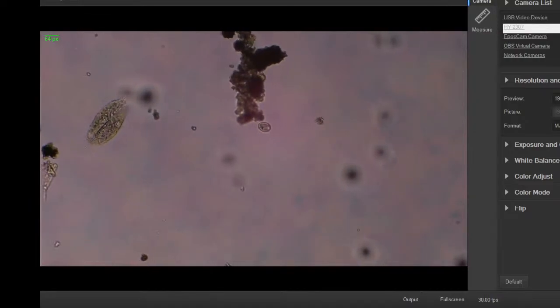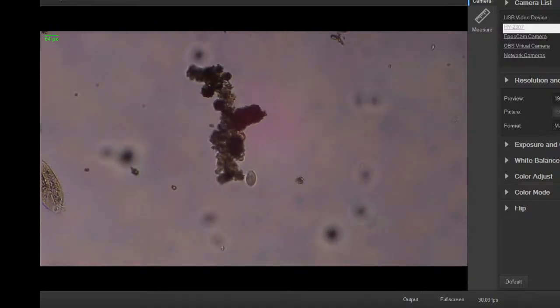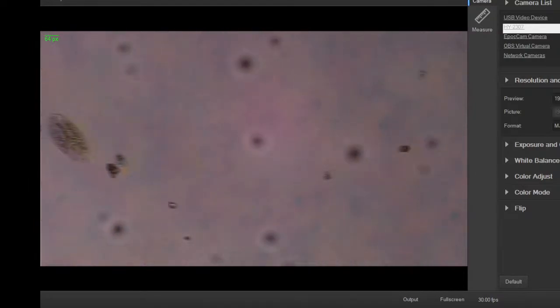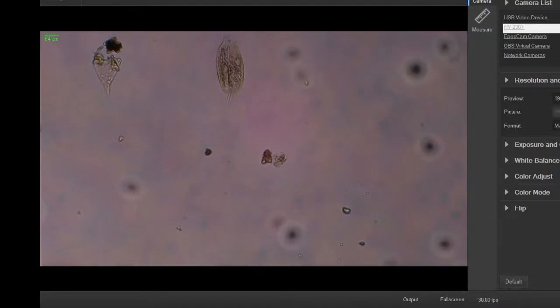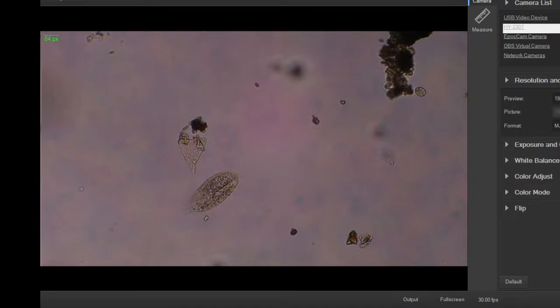It just stopped for some reason. So this is a ciliate here. The little guy might be a flagellate. His movement's a little bit more jerky. But I want to follow this guy because he's nice. This is not even very high power. This is about 100 power.